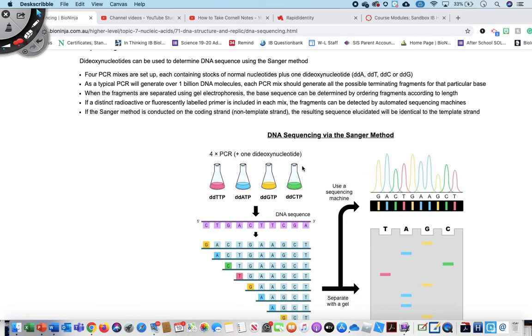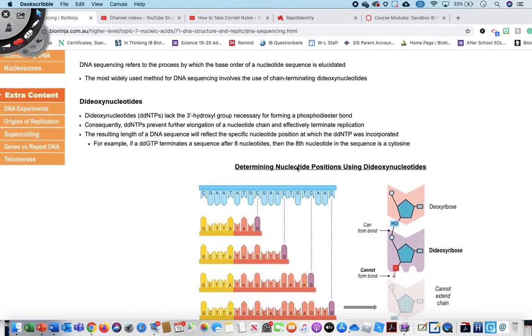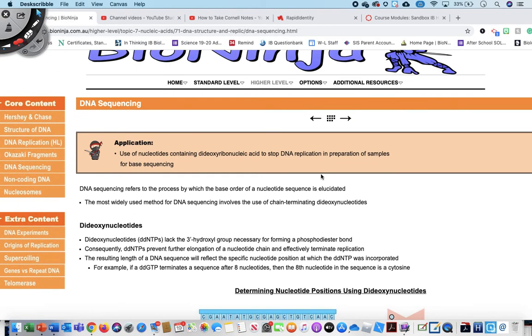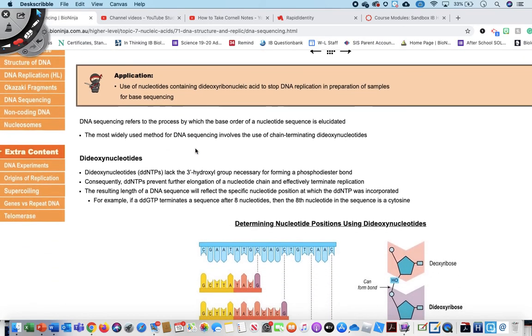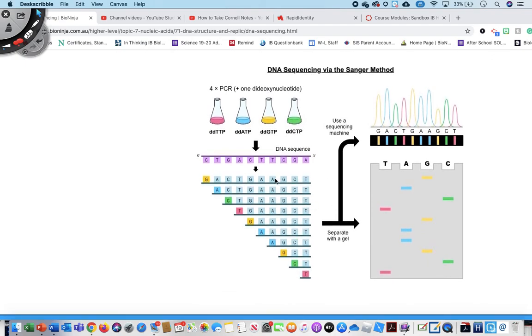So there's a few videos also that you can watch on the Sanger technique. As you can tell, it's a bit complex. It's a simple technique, right? But it sounds complex, and it's definitely not as easy to understand.